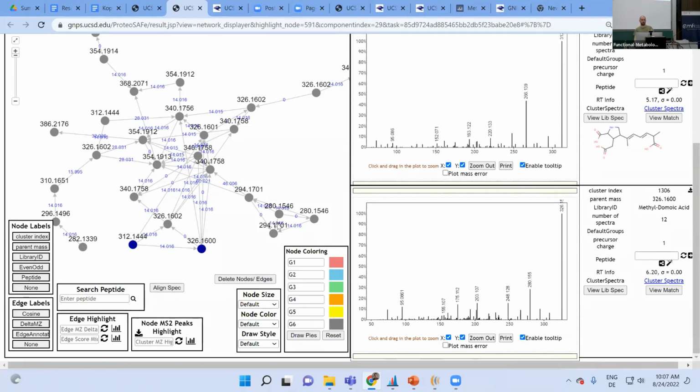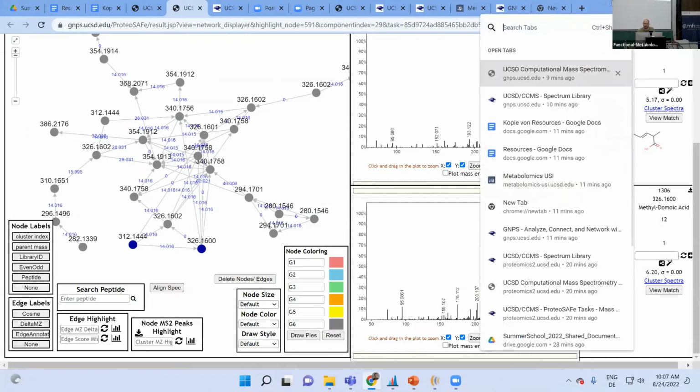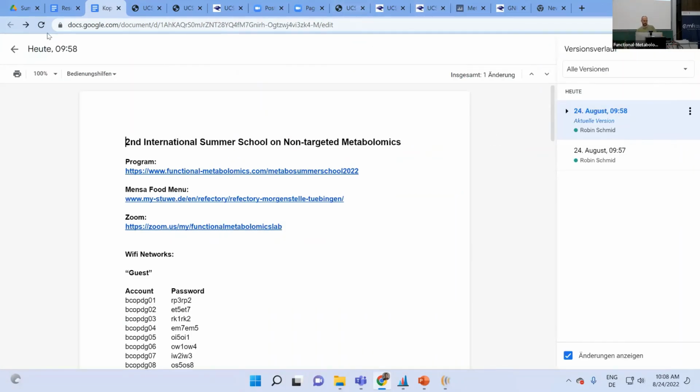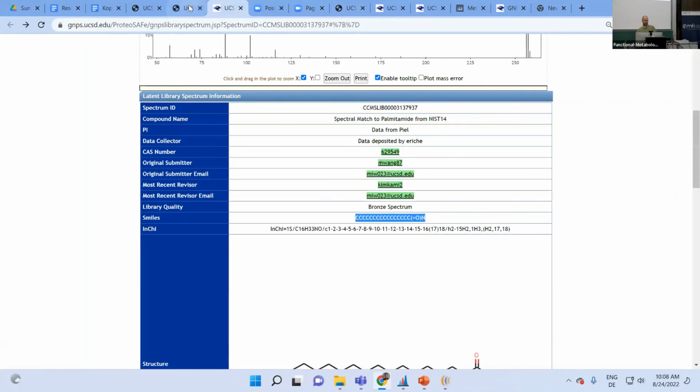So I wanted to show you what you can do here, but now the next step is to actually pull this down and, you know, what was it? Alt? Alt modify on top. Control Alt Shift. Thank you.